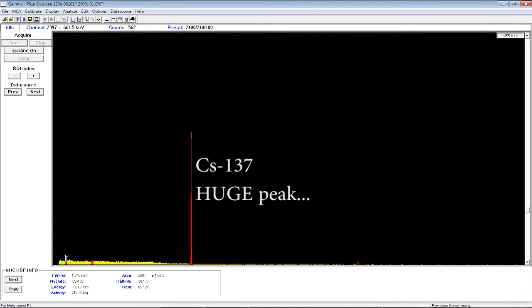This is not entirely accurate, of course, because of the soil and everything in there, but it should give you a perspective on things. That the apple, 4 kilometers away from the Chernobyl nuclear power plant, is much, much less contaminated than these particular mushrooms collected in the Bavarian forests in Germany. Same isotope, same origin. Now, that's quite interesting, isn't it?